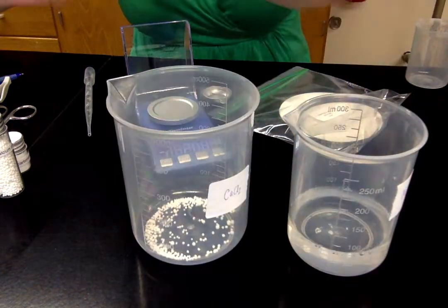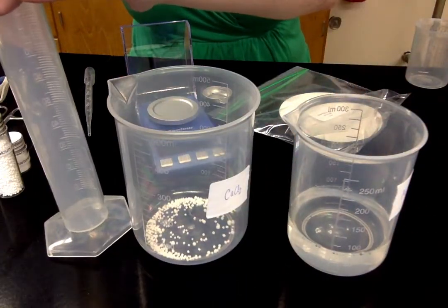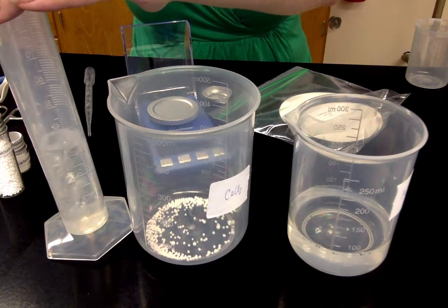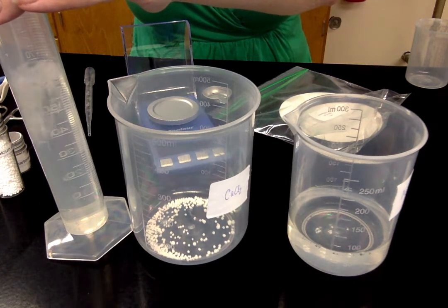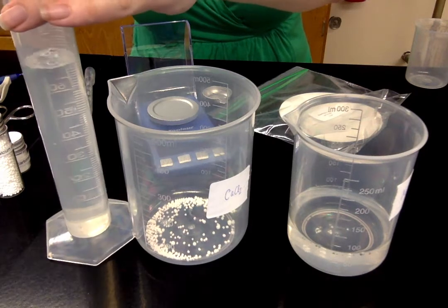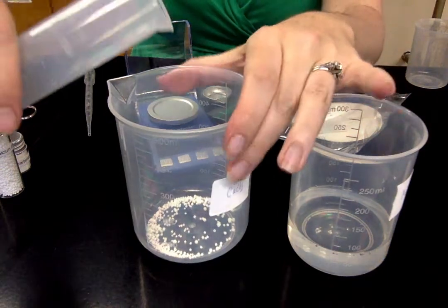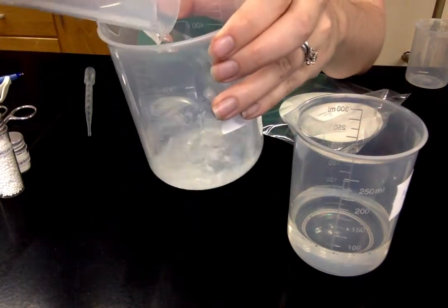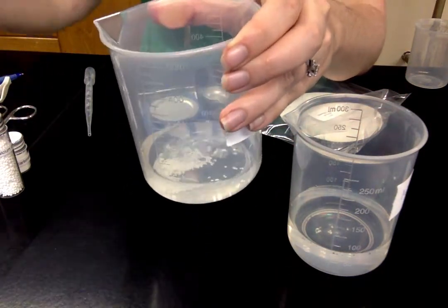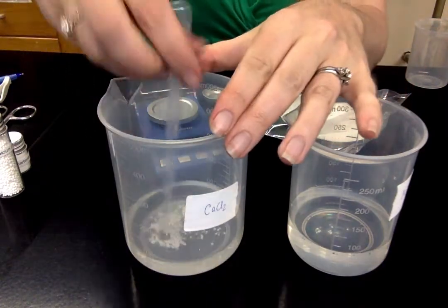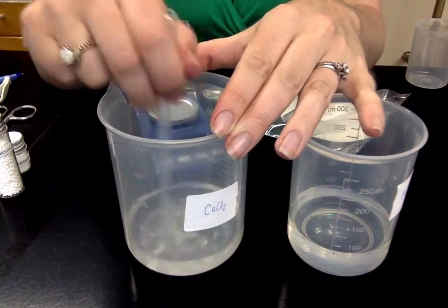And we're going to do the same thing to our calcium chloride. I guess I'll keep these in the screen here. So I've got my graduated cylinder. Putting in 75 milliliters of water. Getting it exactly at 75. And adding this to my solute. And again, I'm going to stir it. Stir it until it is all completely dissolved.